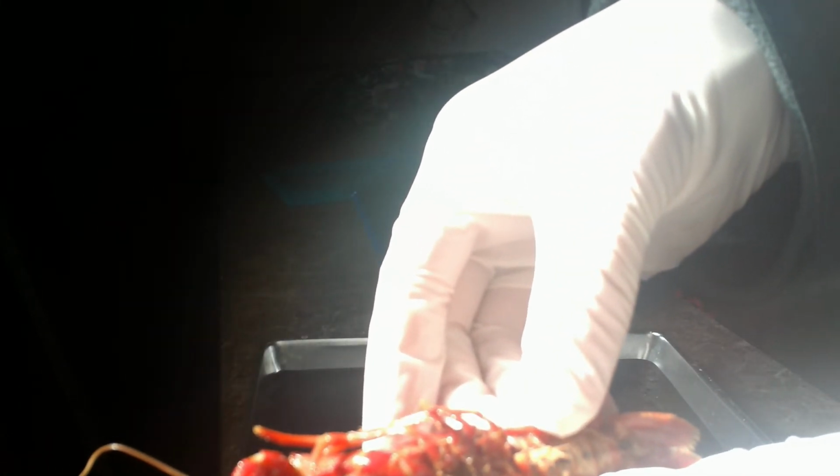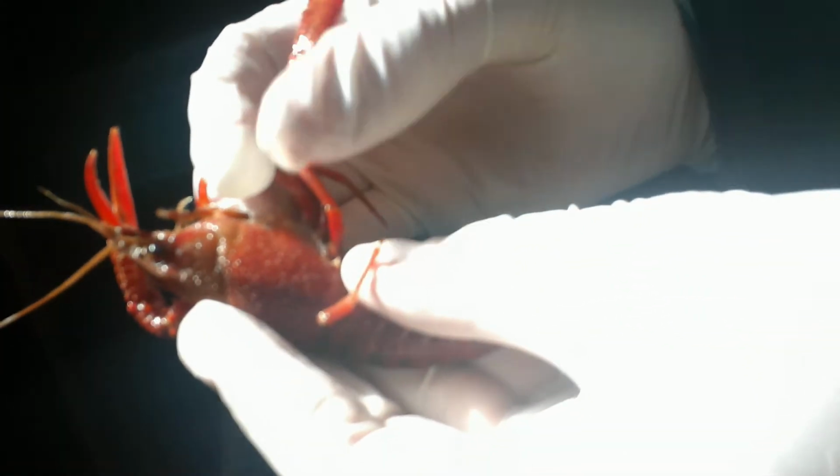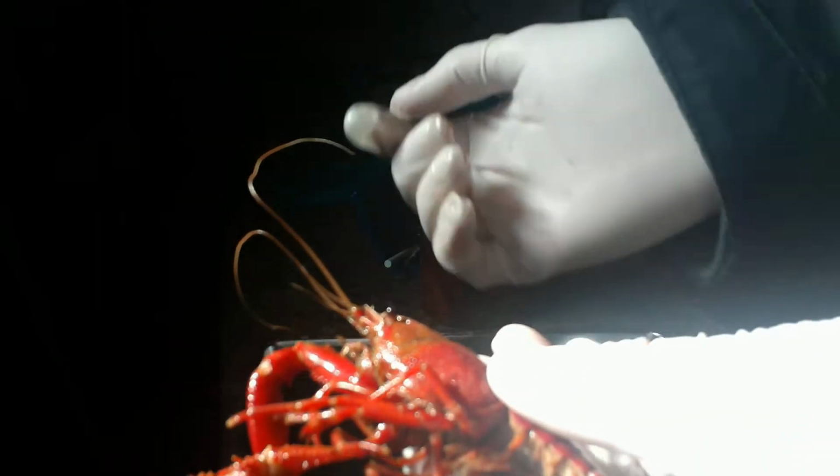Okay. We have some other legs down here that are not quite as big. These would be our pleopods all the way down here. Our gills for these guys, if we move these legs up, you can kind of see these hairy looking things right here. There we go. Okay, the light colored piece. Those are our gills. So that's what the crawdad's going to use to breathe.